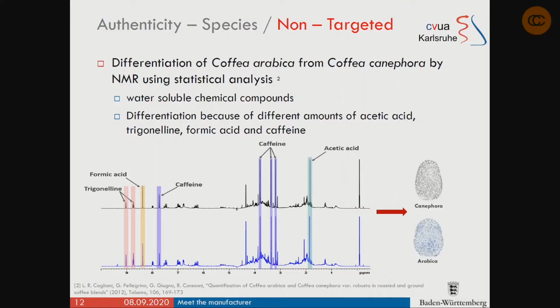If you look at 4.3, there is a peak that I think is different. That it's like double as high. You mean this one? This one, for instance? Yeah, this is also trigonelline. Yes. And then you could also see the one at around 2. There is one with the Arabica that is also significantly higher than with the Canephora.